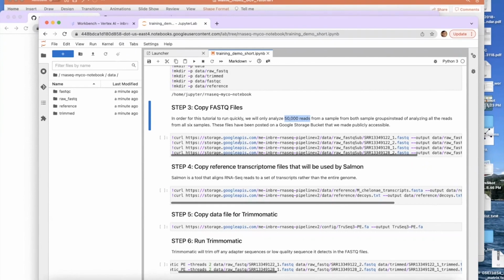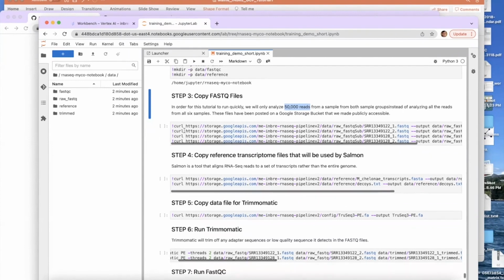So it might be just files that you alone can access, or maybe a group of users can access, or in this case, anyone can access. So you can choose the access. And on GCP, one can access these Google Cloud buckets. Every bucket has a unique name, and this is the name that we happen to use.